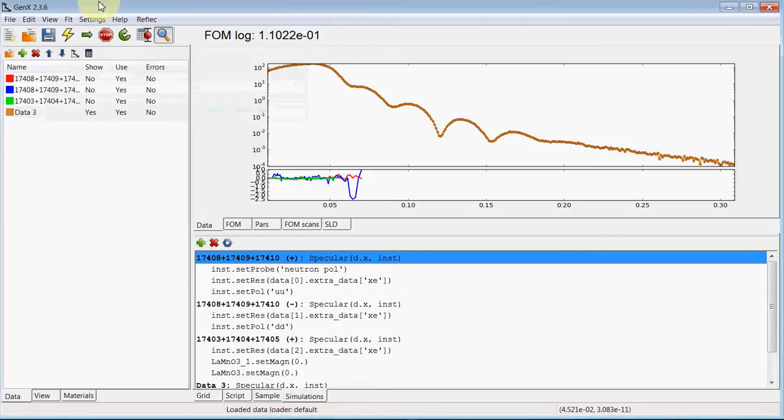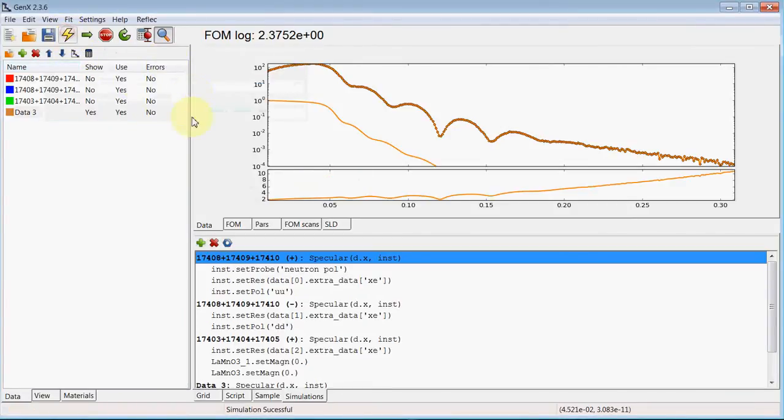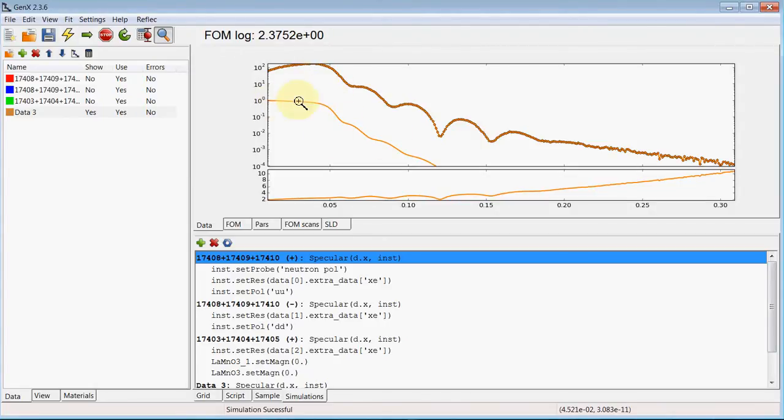Now I can simulate this and you see this is already an X-ray profile, but it doesn't include the footprint correction we need because the beam is bigger than the sample and it has the wrong scaling.